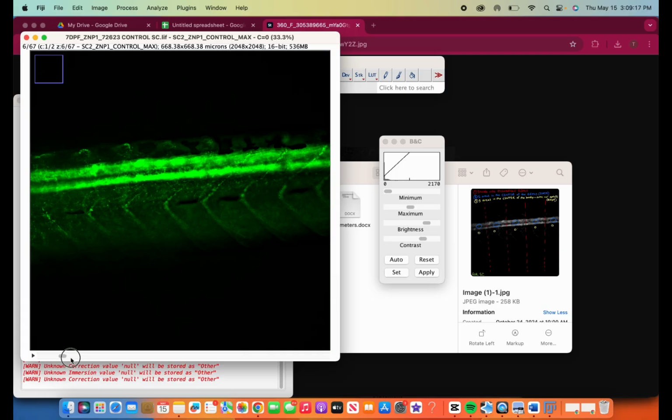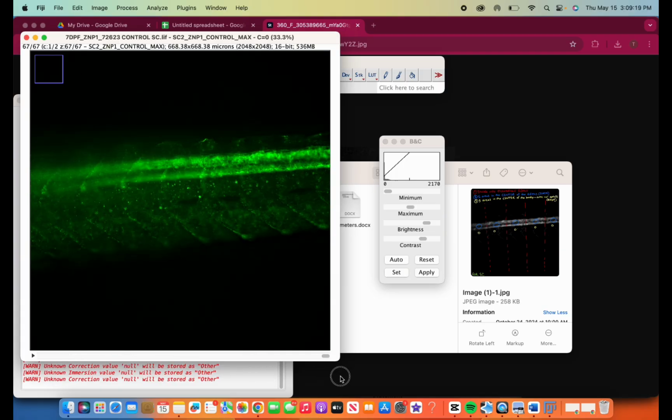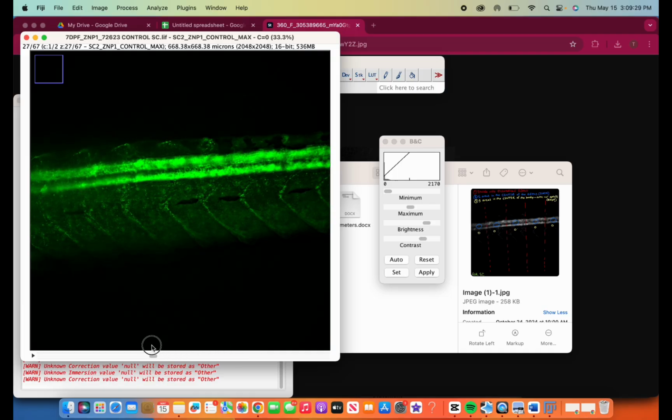An example of when it would get muddy would be if, for example, you see how when I drag it all the way here, it gets kind of blurry? Something I can do is note the earliest time in which it begins to get blurry. So it looks like it's pretty solid until maybe like 30. Let's say 30 to be safe.